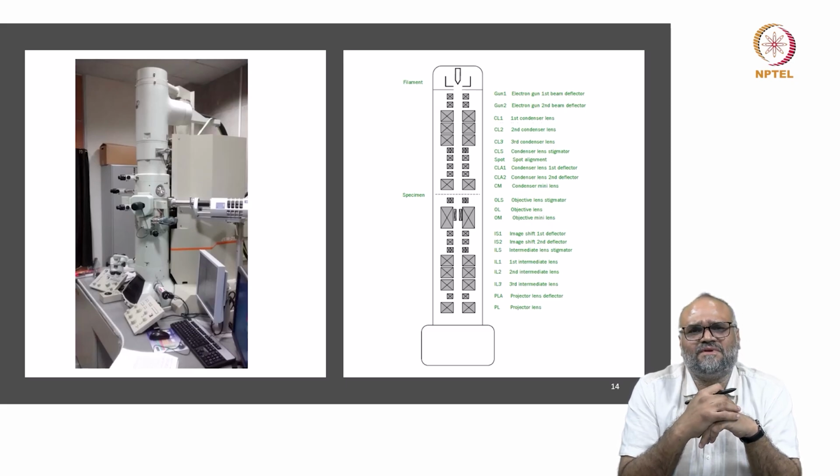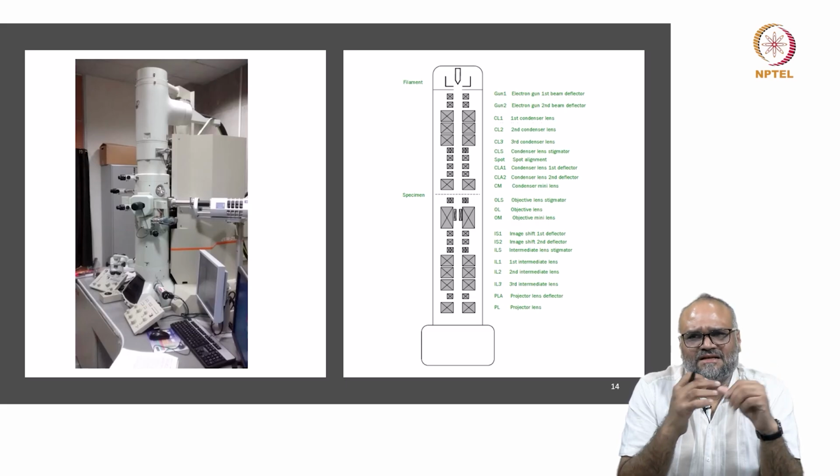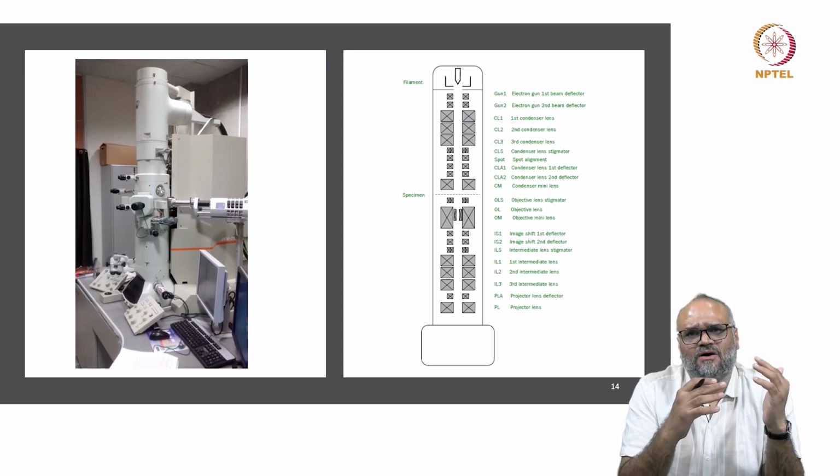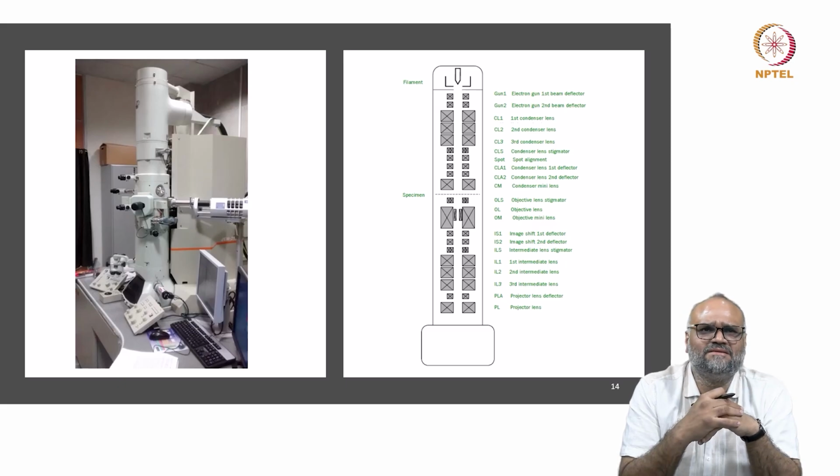The same kind of phenomenon happens in light, when light passes through transparent objects, lenses, rectangular blocks or a prism, you might have either dispersion or refraction of light.